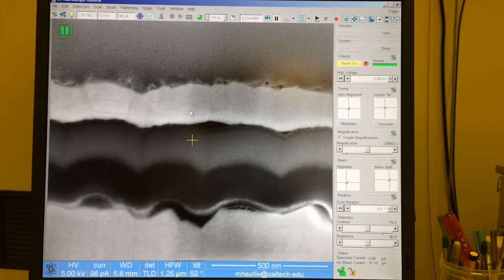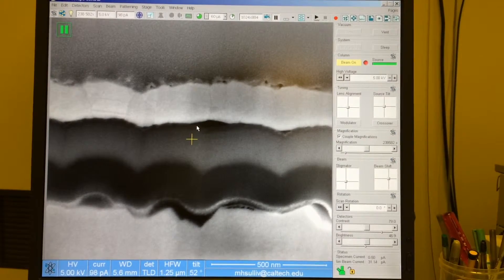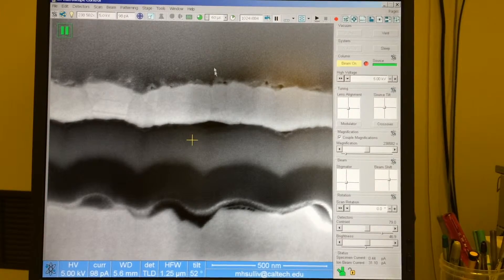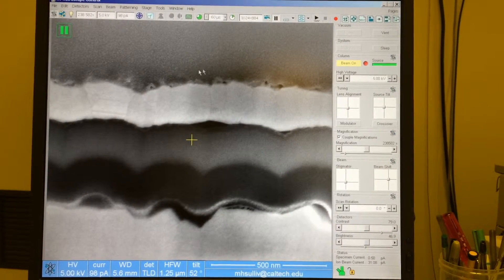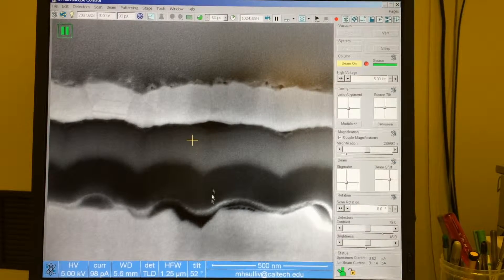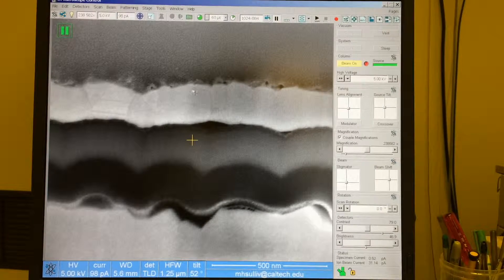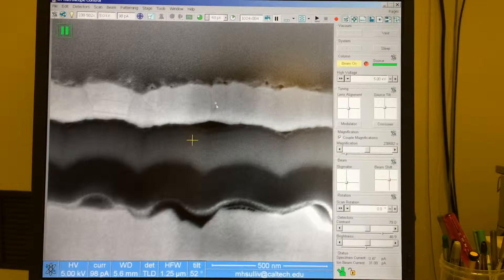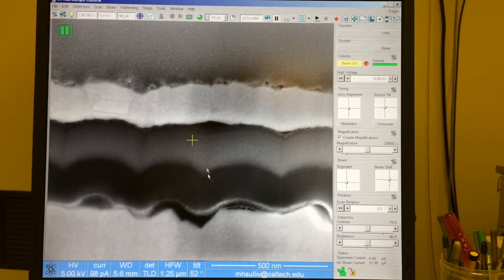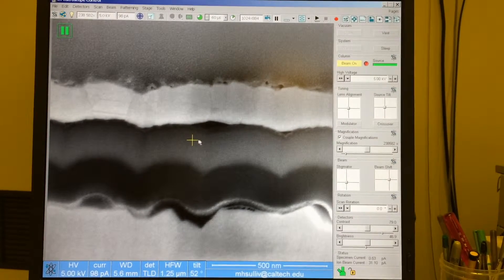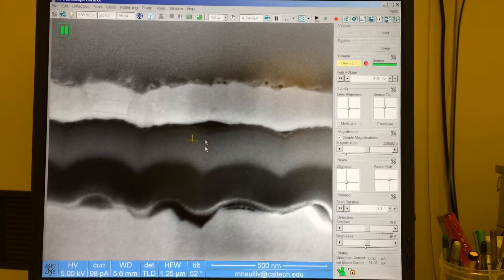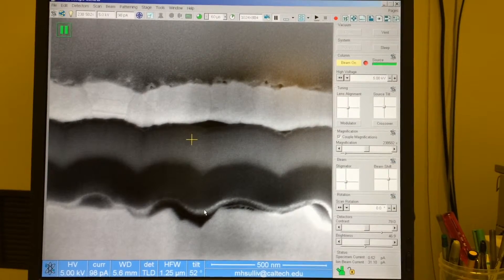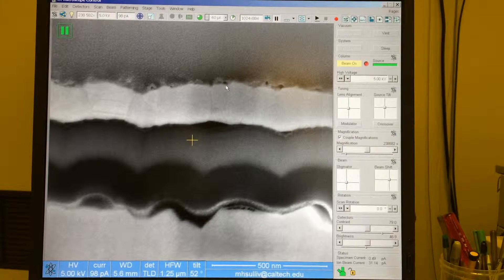So in this case, we're tilted, so the beam is not normal to the surface. So we have a slightly different focal plane to get perfect focus up here versus perfect focus down here. So if you're looking to make a measurement on a particular layer, then you should do your alignment in line with that layer. In this case, we might be able to move our focus a little bit to the right or the left to try to adjust the focal plane as it contacts the surface. So that's something that you can do with your own sample.